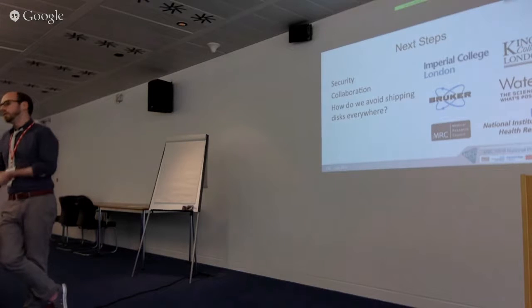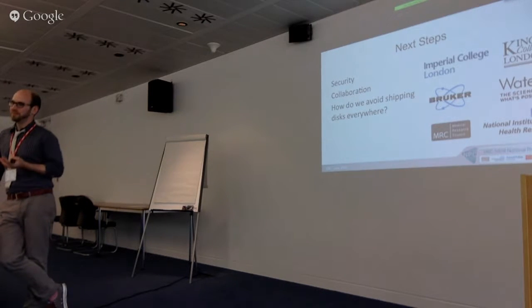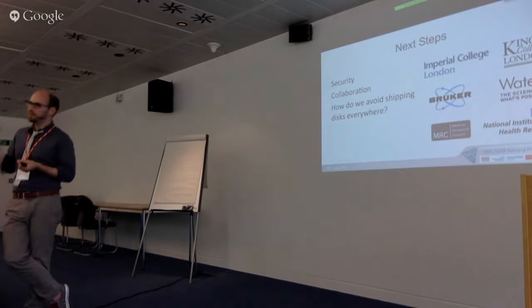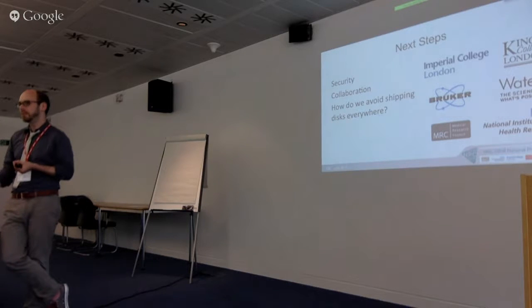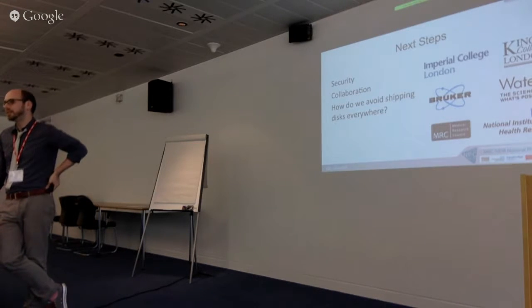Also the kind of things we talk about removing, denoising, is nothing that even a trained spectroscopist would tend to think was. So these are the kind of little transient blips that, if you look at that across an entire sample data, you'll see enough noise in one place where most people are able to go, oh, maybe something here, and turn it into, when an actual analyst comes back to look at this, they'll go, it's nothing. But by that point, it's too late to pass that through.